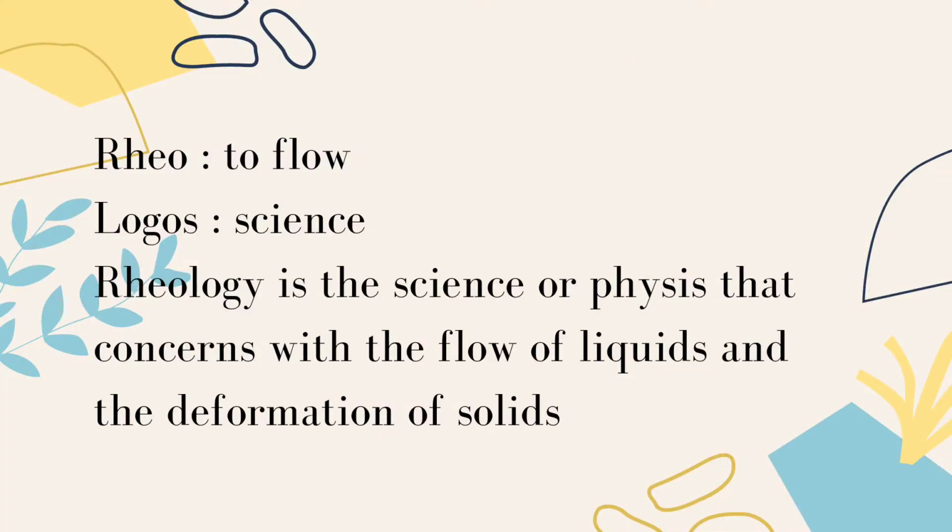Today I will do an experiment about rheology. Please keep watching. What is rheology? Rheo is to flow, logos is science, so rheology is the science or physics that concerns the flow of liquids and the deformation of solids.